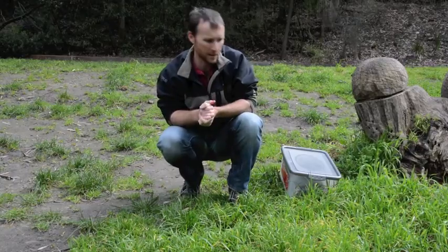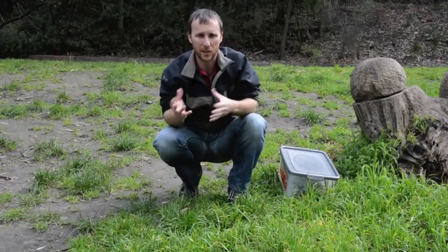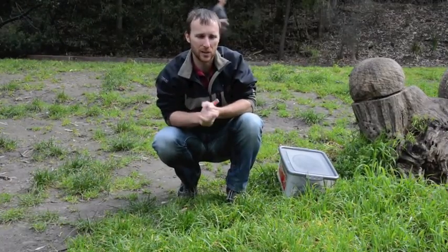Today I'm going to take you through the process to take water samples for environmental DNA analysis. First and foremost is making sure that you're safe — checking your environment and making sure that there are no hazards that are going to pose a risk to you.